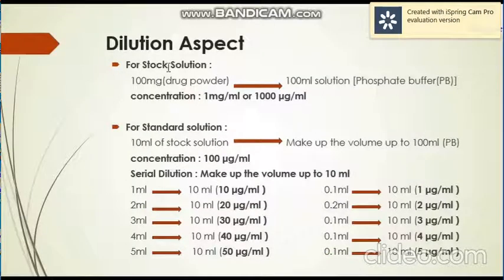It will entirely depend upon the availability of the drug and the strength of the drug. Sometimes it has been seen the drugs are quite costly. In that case you can perform this study by taking 10 mg of drug, even 5 mg or 1 mg of drug. Accordingly the amount of solution where the drug will be dissolved will change. That is called stock solution preparation.